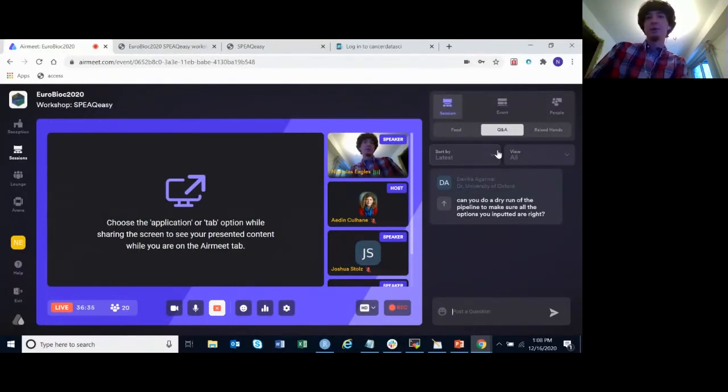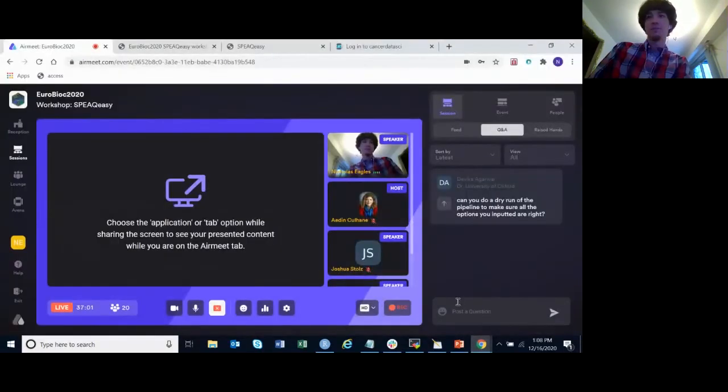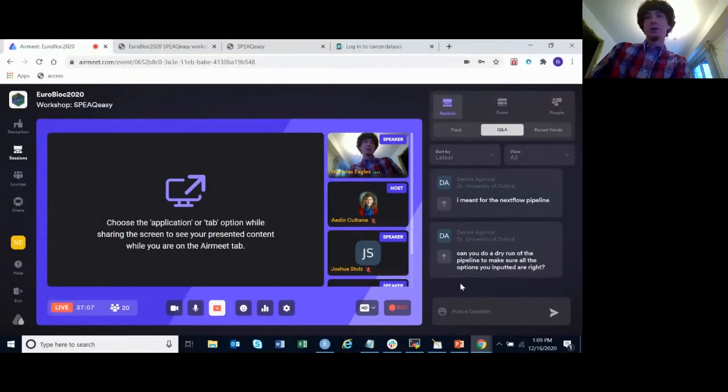Okay, so this is for input. I don't believe we provided input data for the run. This was just an example, actually from the Speakeasy example. I think the question might be more in general. Like, can you, for example, just run Nextflow without actually having all the jobs submitted? Right? Yes, just to test that it's installed.